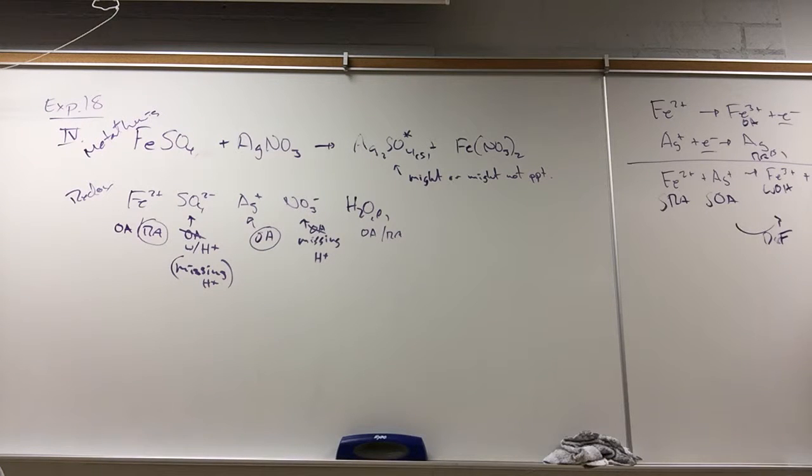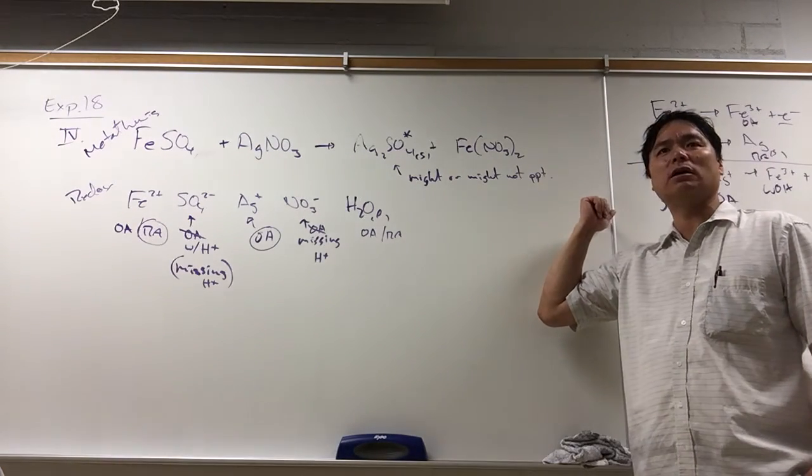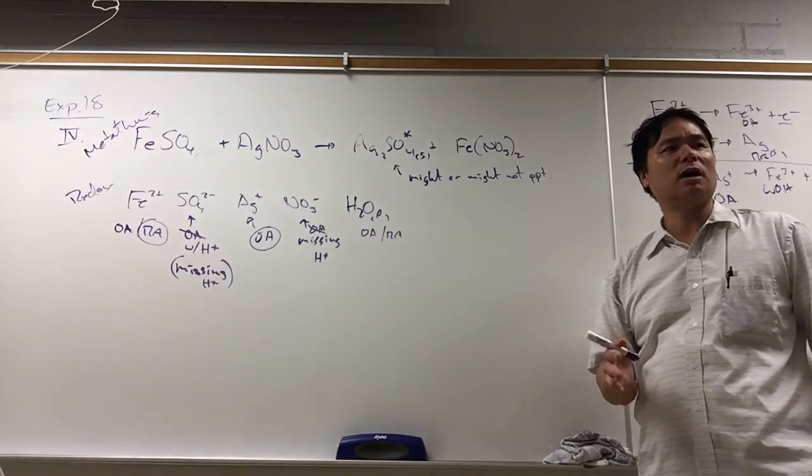Usually metals will reflect all colors of light, while black substances absorb, so the visible light is being scattered away or absorbed. And so in that sense, the crystals appear black. As those crystals grow bigger and bigger, then we see the metallic silver form. And so this reaction is actually two competing reactions. It turns out the driving force for this one is stronger, and therefore the redox one dominates.